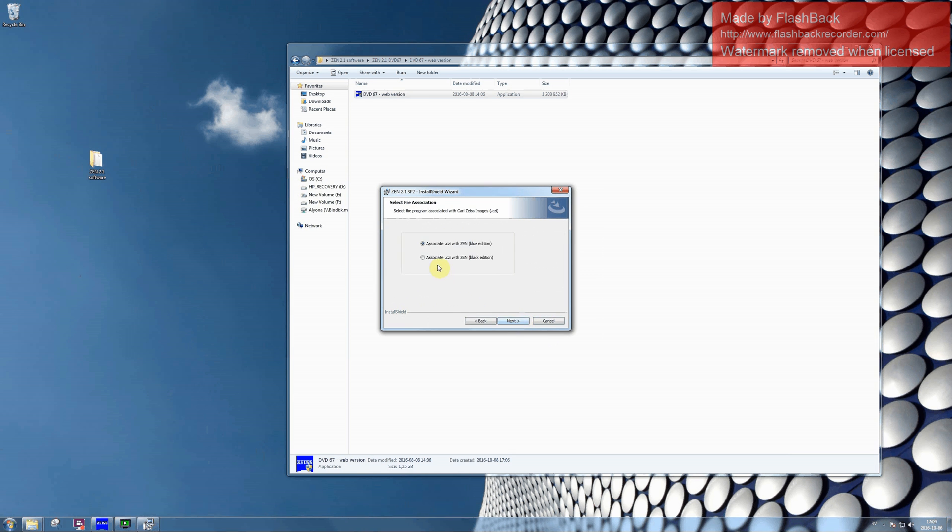I would advise you to associate Carl Zeiss image files with Zen Black and click on Install.